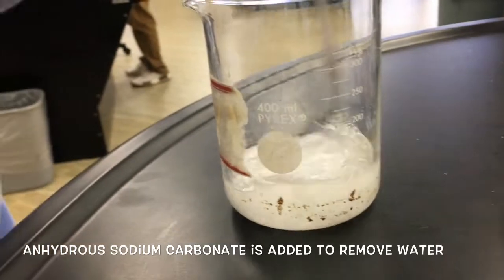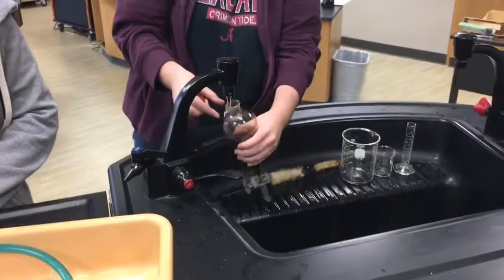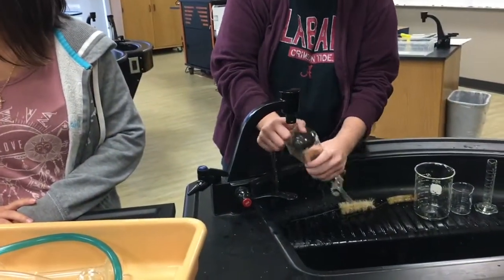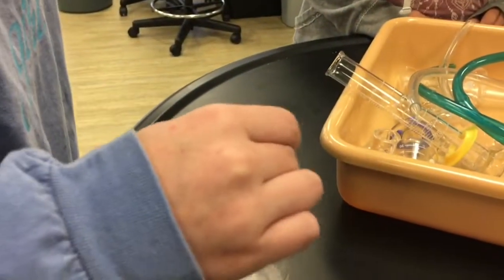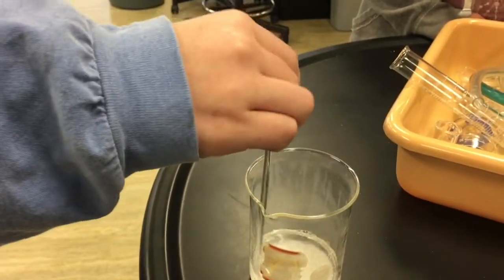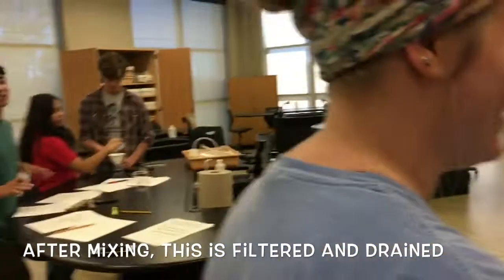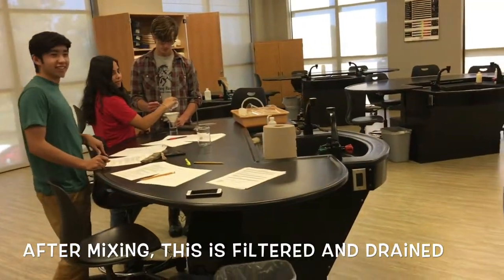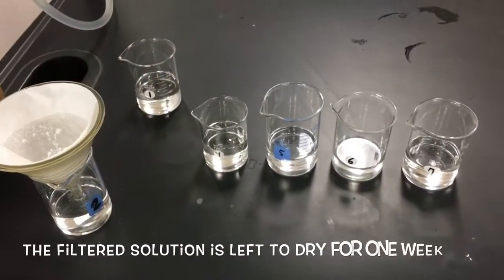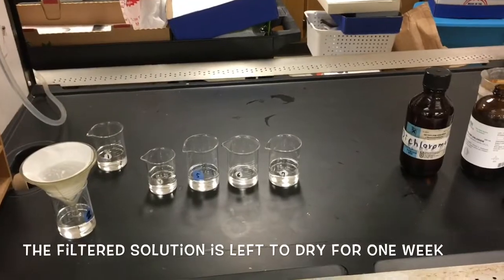So we added anhydrous carbonate powder, and we're stirring it, then we're going to filter it. Lori is washing our glassware. It's not going to completely dissolve — that's what the filter paper is for. All right, final step: we're putting this under the drying hood, and we wait until next week to see how much caffeine we extracted.